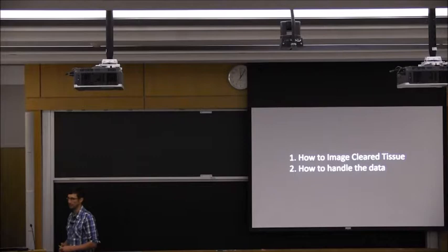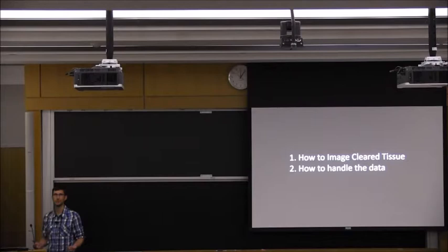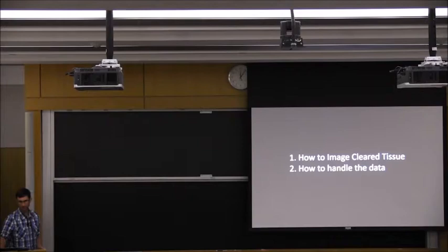So the second part about how to handle data is not going to be just specific to cleared tissue. It's going to be more about how we handle large amounts of data, because obviously cleared tissue is not the only thing producing big data. All kinds of systems are generating terabytes and terabytes of data.